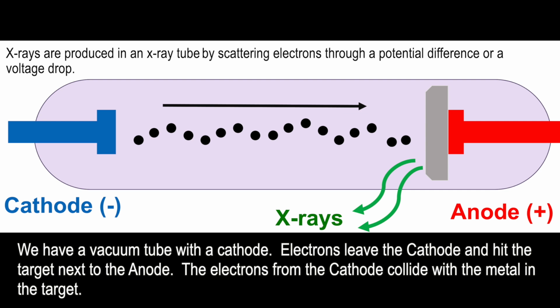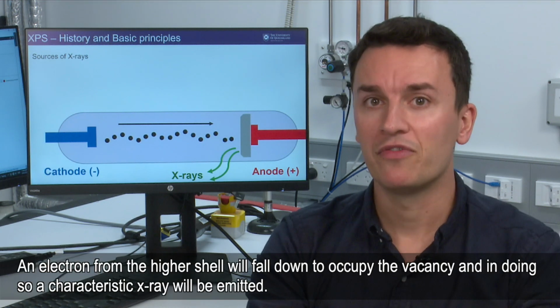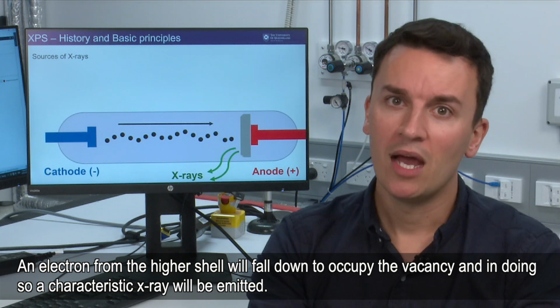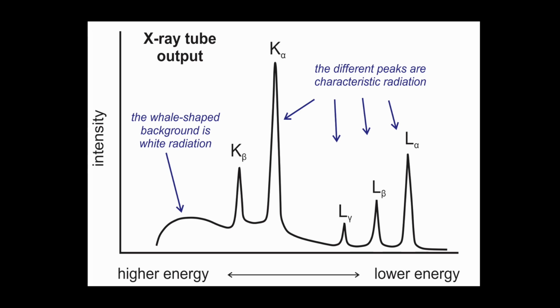Electrons leave the cathode and hit the target next to the anode, and the electrons from the cathode will collide with the metal in the target, the atoms here. This will kick out an electron, leaving a vacancy. An electron from a higher shell will then fall down to occupy that vacancy, and in doing so, a characteristic X-ray will be emitted.